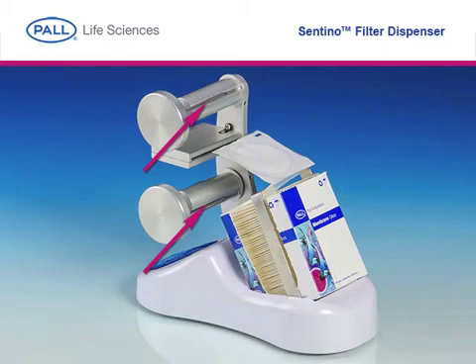Then adjust the upper spool so the retention groove is in the 2 o'clock position and the lower spool is in the 4 o'clock position.